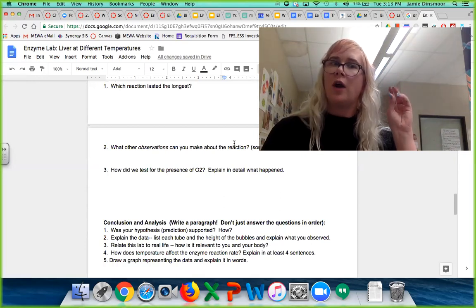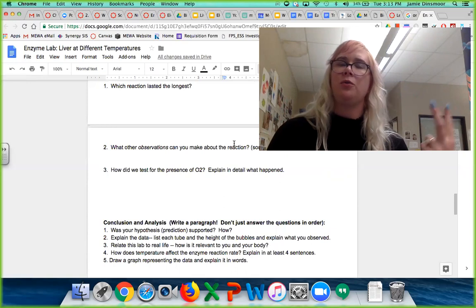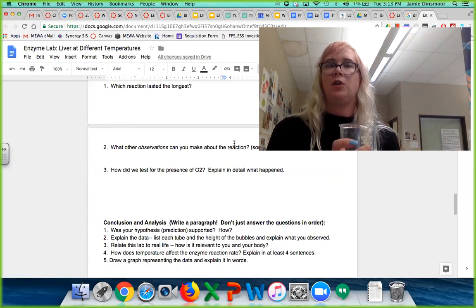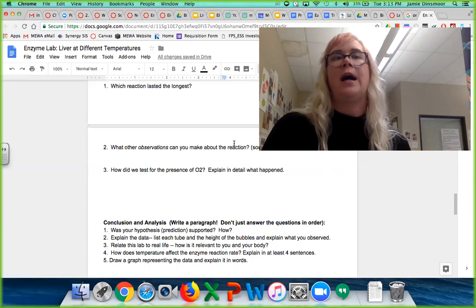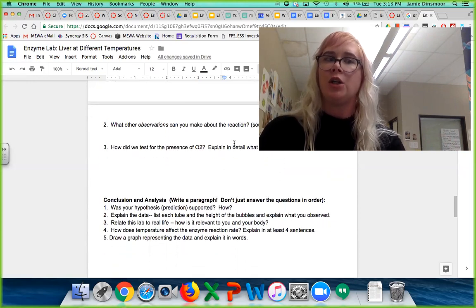So there's a very crackly, bubbling sound happening, right? Those are two things that tell us that a reaction's happening: the bubbles, and the fact that we feel heat. Some reactions you might feel cold or other things like that, right? But in this case, those are two observations that you could definitely make about this reaction that maybe are sort of lost virtually.